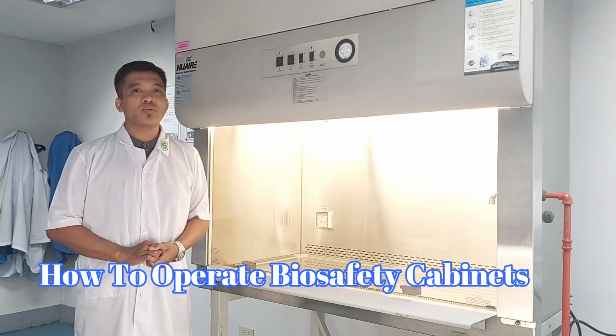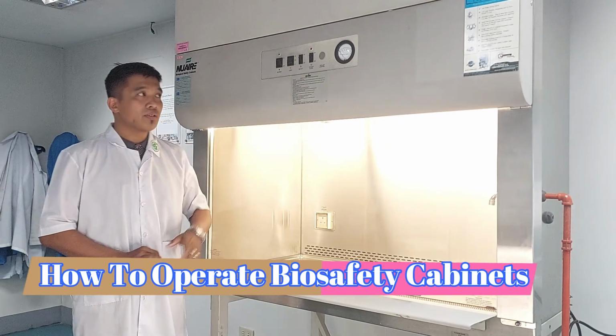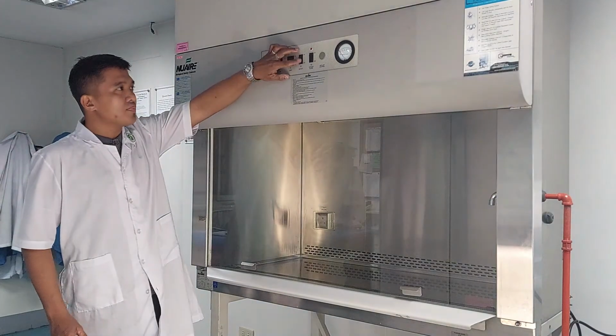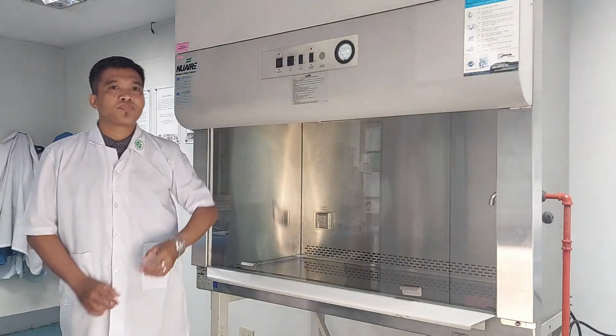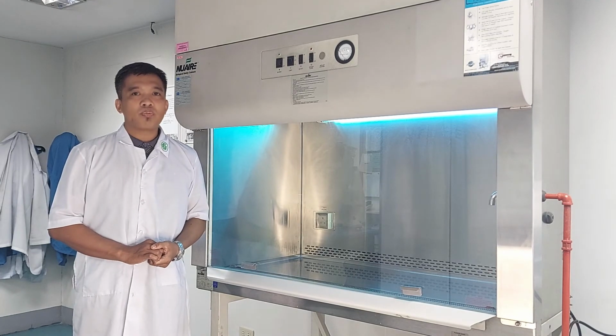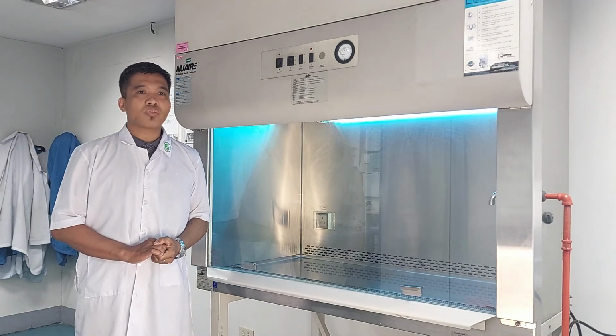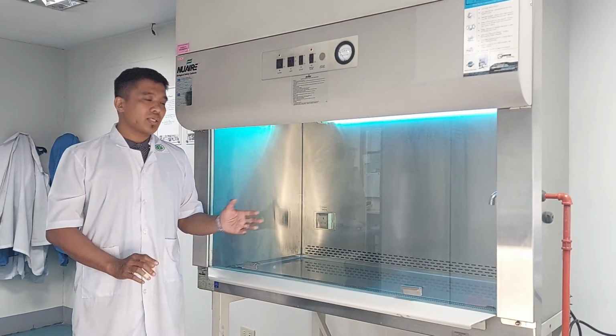Turn on the unit and switch on the UV light for 5 to 10 minutes to decontaminate the working area. Allow the unit to operate for 5 to 10 more minutes before activity to stabilize the environment within the cabinet work zone. Place supplies in the cabinet.